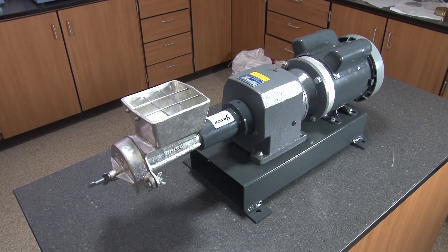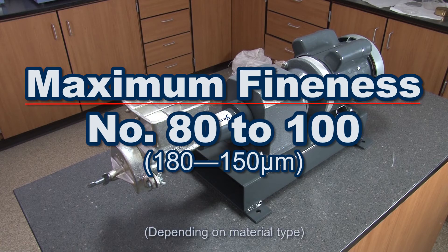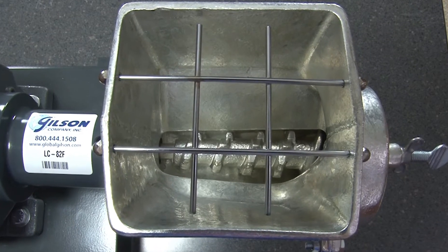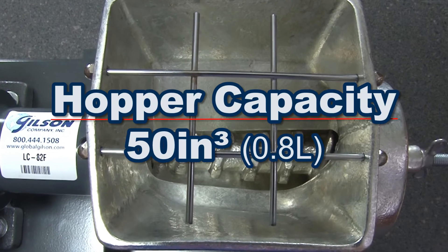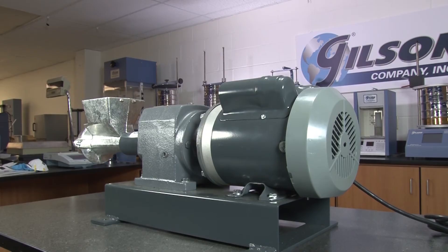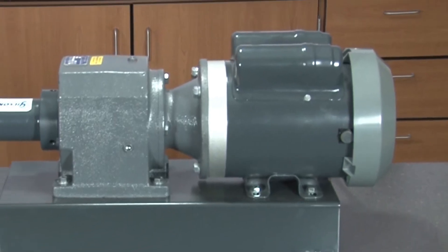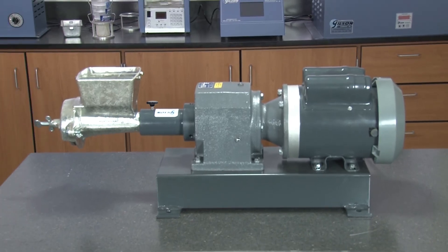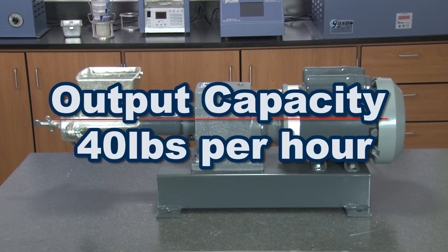And in one pass, this rugged unit can grind material to 80 to 100 mesh particle size. The volume capacity of the feed hopper is a full 50 cubic inches. Utilizing its third horsepower gear motor, the revolutions per minute tops out at 89 RPMs. And the maximum throughput capacity is 40 pounds per hour.